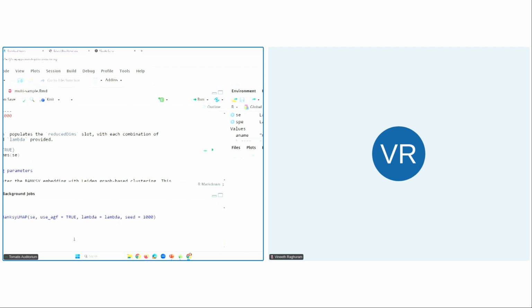And for multimodal, the same answer, I guess: it needs to be matched, so the cell should have those. They say you have multiple aligned data sets that are single cell. Aligned, so I'm guessing that means using integration methods to align cells that were separately measured. I'm not sure.